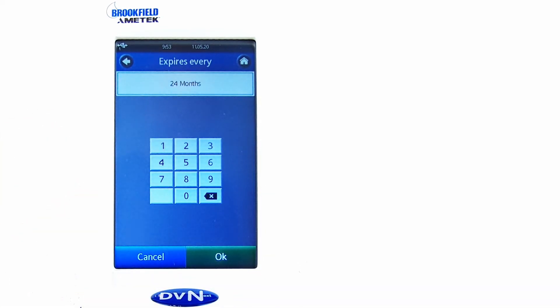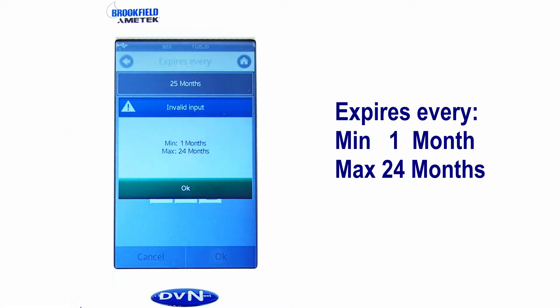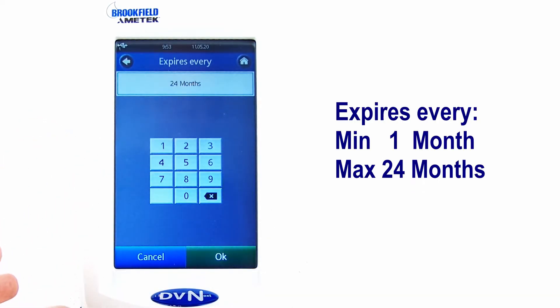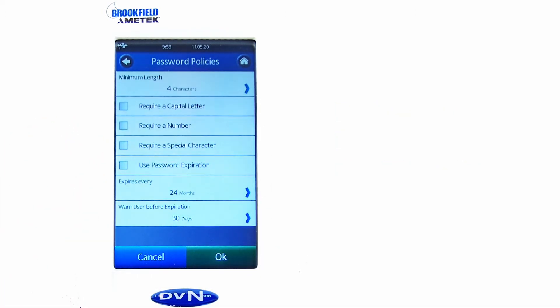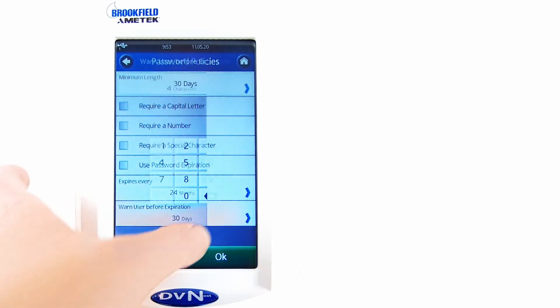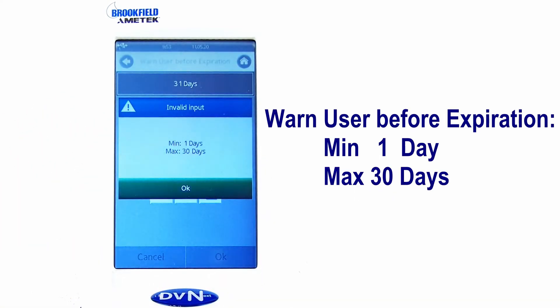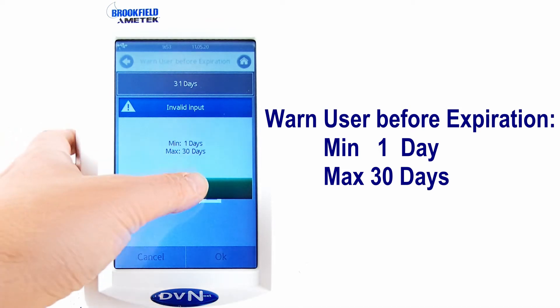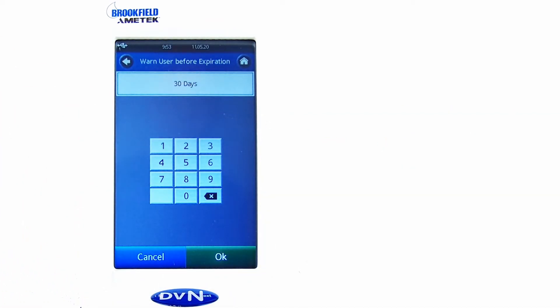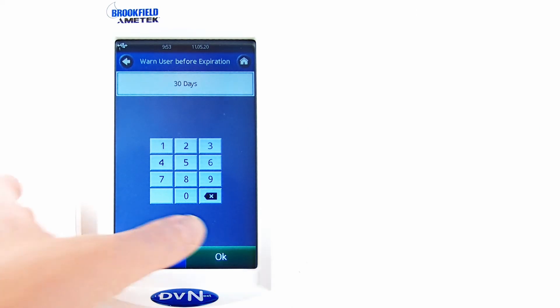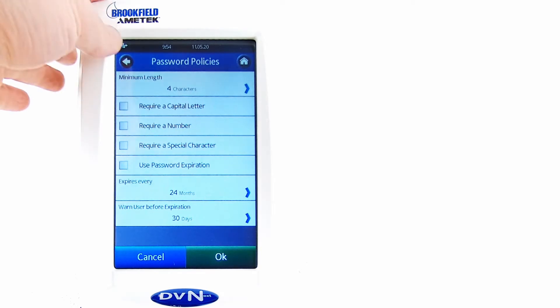You see, you have a lot of options. Go through really all menus to get all settings.